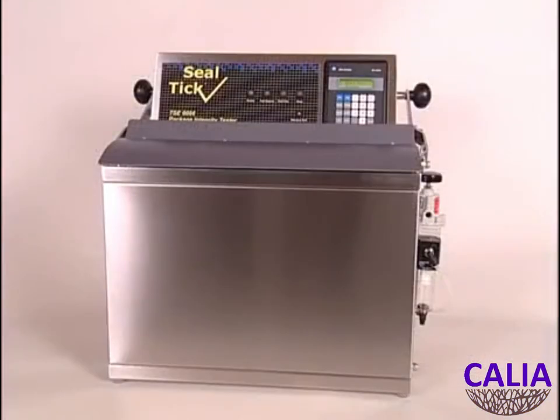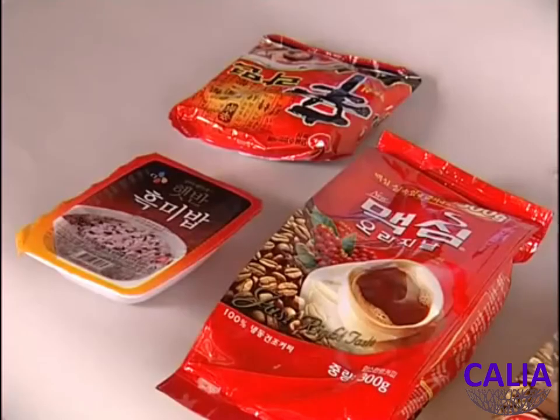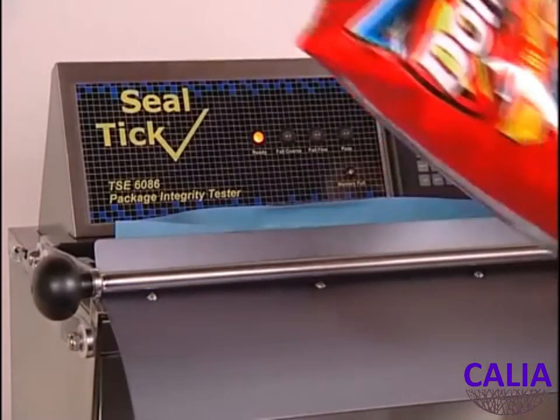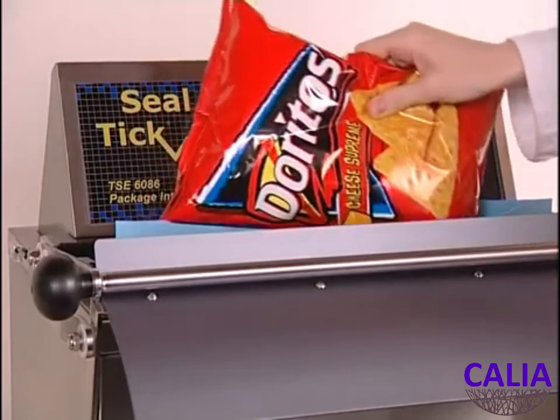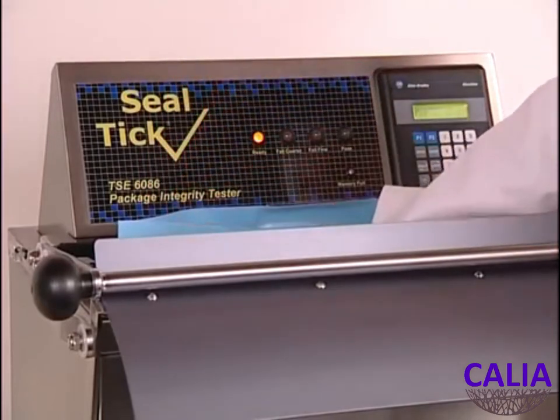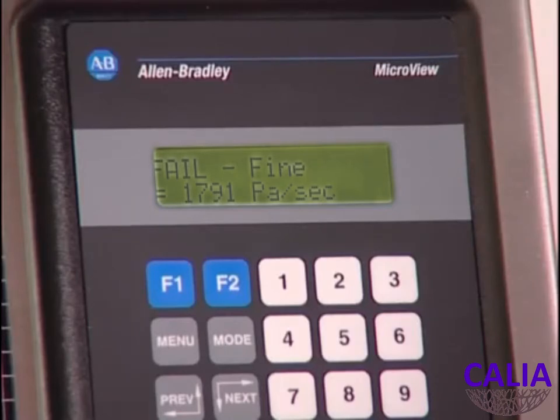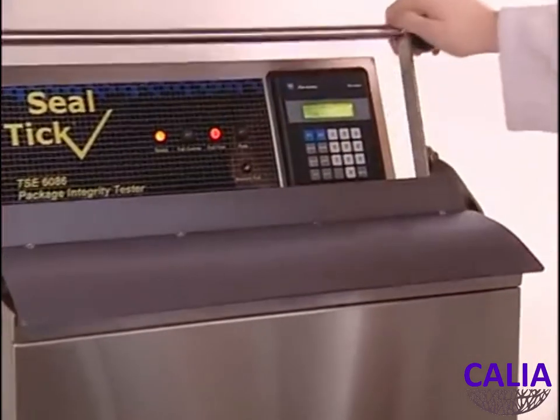The Sealtic TSE 6086 is already in use around the world for testing a wide range of foods and a variety of medical products. Depending on the packing line's speed, it can be used to check 100% of production, selected samples, or allow the operator to check the seal integrity after changes to the film, product or adjustments on the packaging machine.